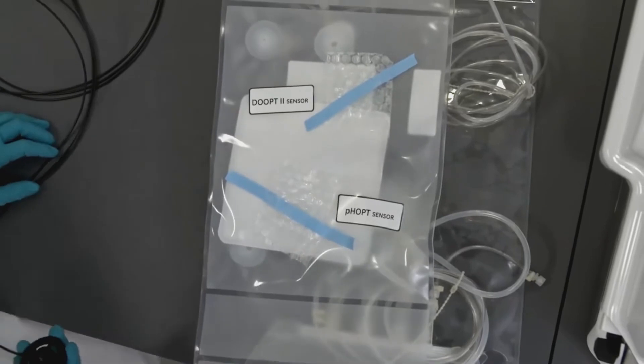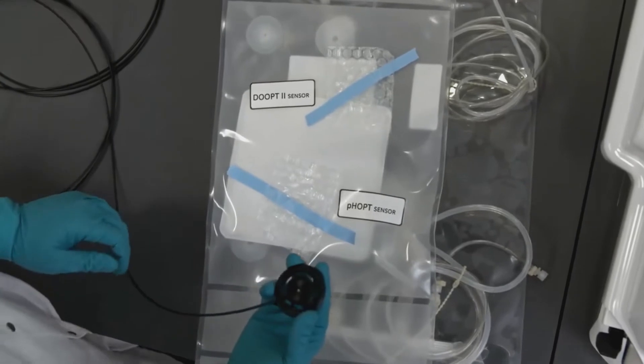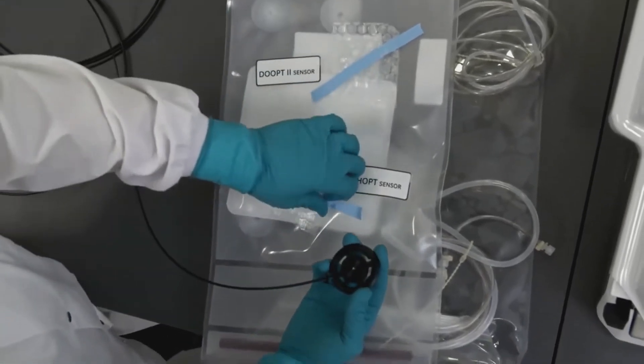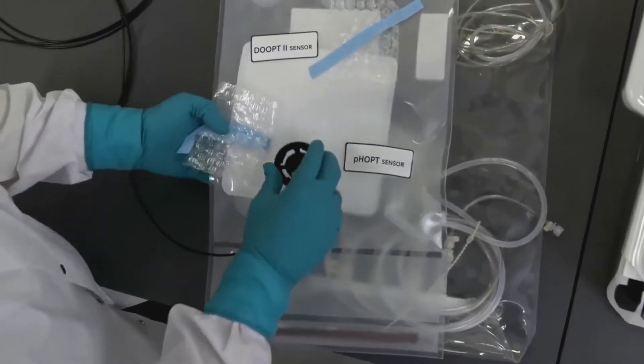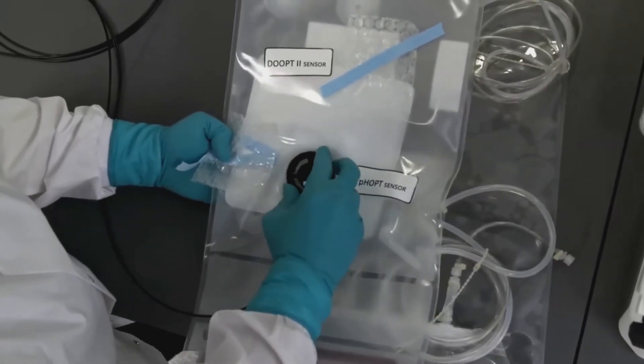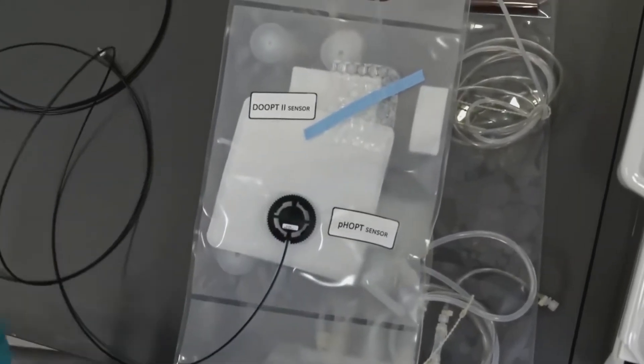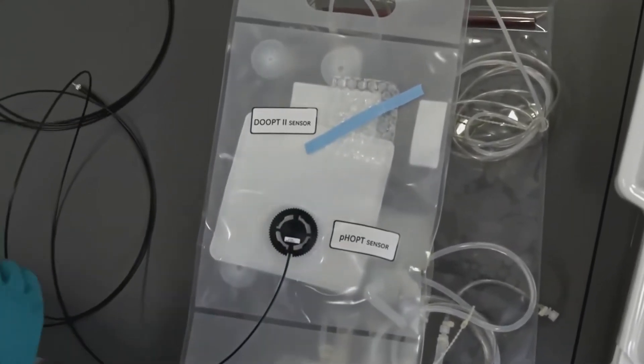So now we'll connect the pH and the DO sensors to the bag. This is on the back of the cell bag. You'll have a sensor that looks like this, and you'll remove the bubble wrap and connect the sensor, and then you can fully remove all the bubble wrap, and you'll do the same for the DO sensor as well.